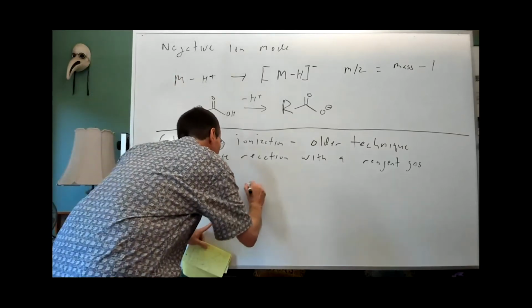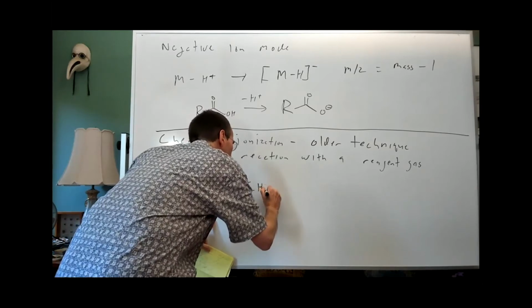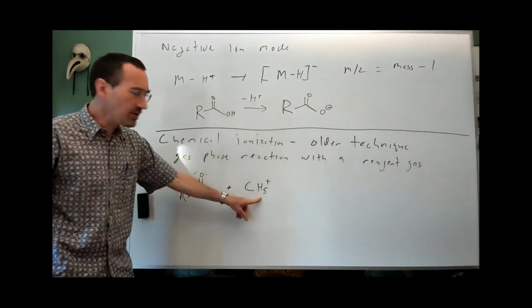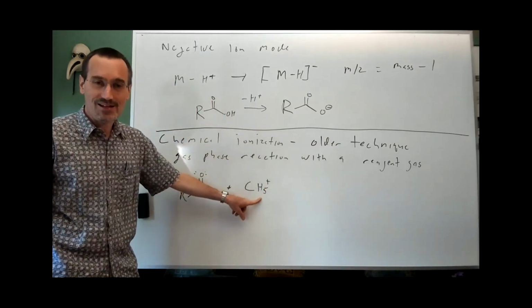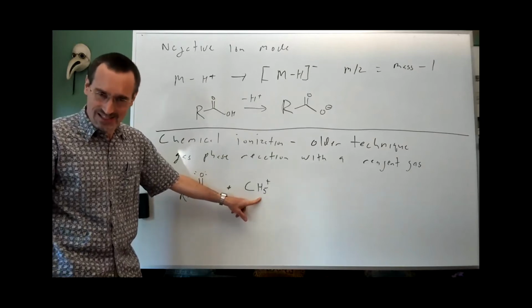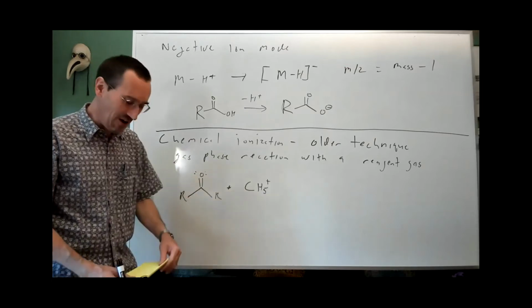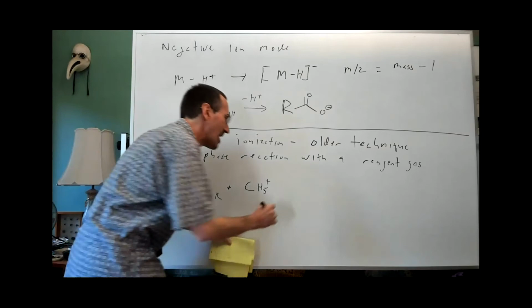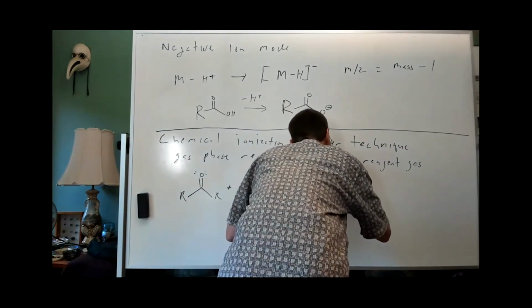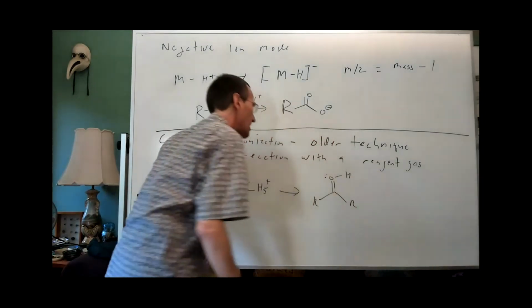So in the gas phase, one of the ionization gases that's used is methane. And in the gas phase, you can generate protonated methane, which should freak you out because you're basically sticking a proton onto the edge of the molecule, and you tell all your sophomores, no, you can't do that. But in the gas phase, that is generated and protonates your lone pair or just about anything for that matter.